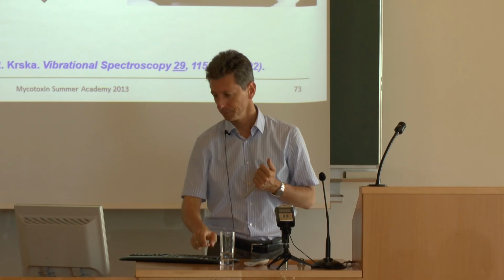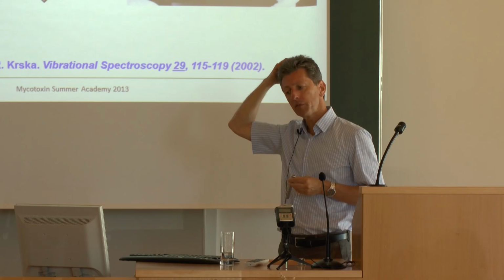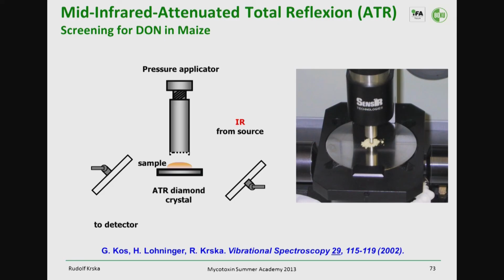Well, that is a method which we have developed on our own, which is one of these emerging methods which might be of interest in the future. For that particular project, I just got last month the indication that we get another 1.5 million euro from the European Commission. It's about mid-infrared screening.